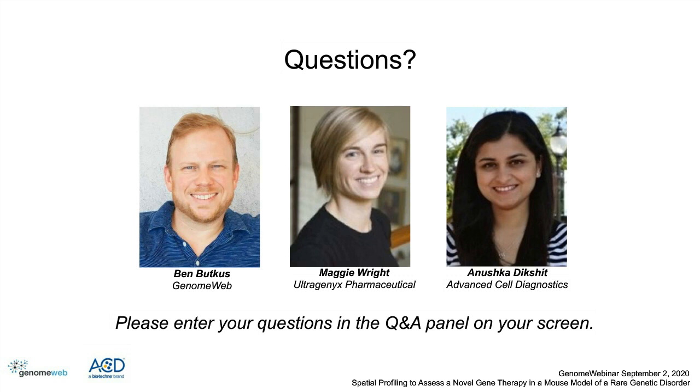Next question is also for Maggie. Have you compared the efficiency of translation of human CDKL5 in the mouse brain? Specifically the translation, we haven't, no. We've looked a little bit at how the cells process the human CDKL5 protein, but we have not yet looked specifically at the efficiency of the translation of the mRNA. We felt pretty confident that we were getting robust levels based on what we were seeing with the RNASCOPE images, but it's not something that we've quantified or analyzed any further beyond that.